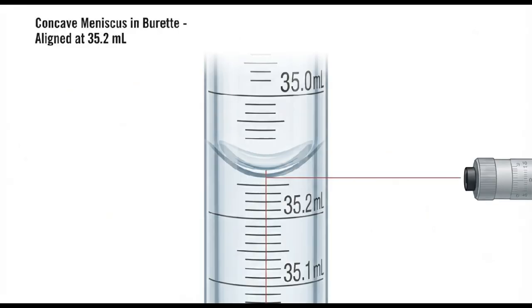Reading burette. After reaching the endpoint, record the final burette reading. The volume of titrant consumed is calculated by subtracting the initial reading from the final reading. The burette should be read carefully at eye level to minimize parallax error.